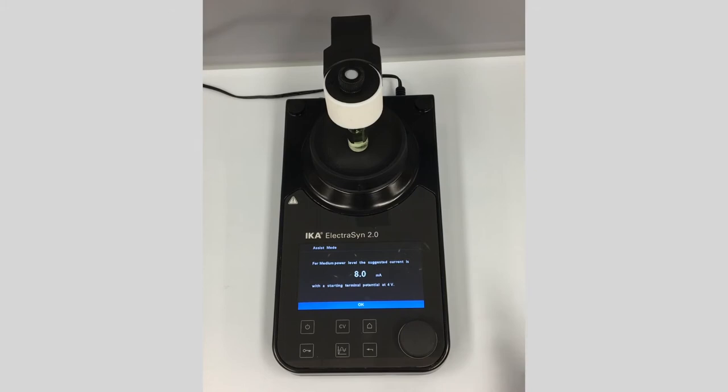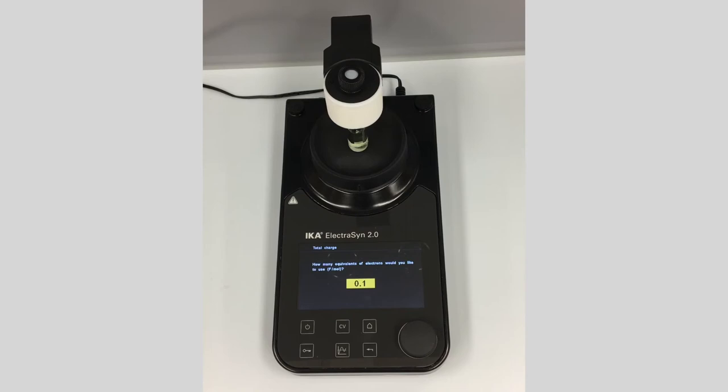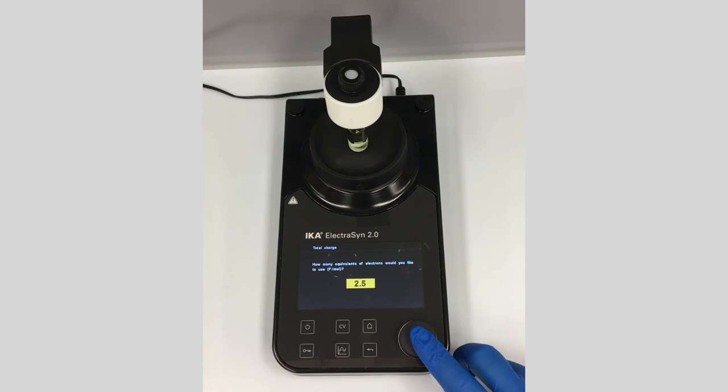Click OK and it asks for the number of equivalents of electrons — referred to as Faradays per mole in the electrochemical literature. As a synthetic organic chemist, think of this as stoichiometry of electrons. This is a two-electron reductive process, so you could choose two, but I'm going to run this at 2.5 Faradays per mole.